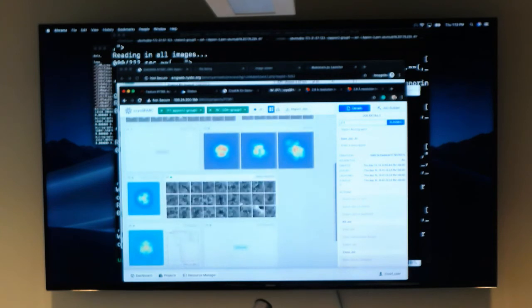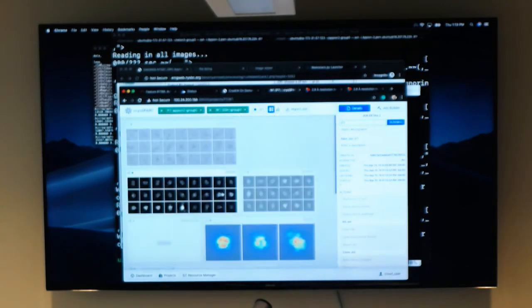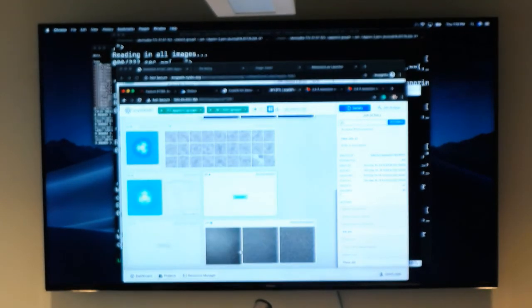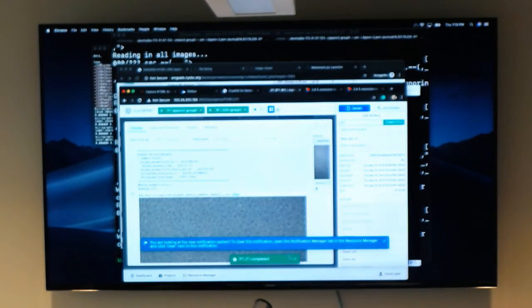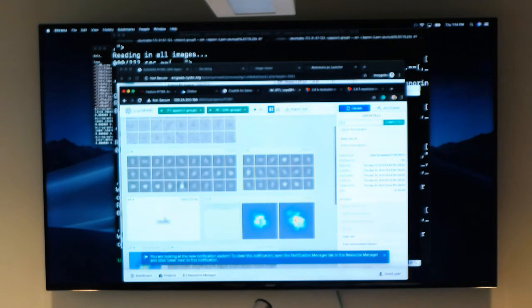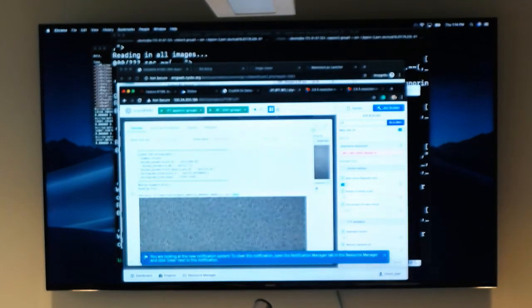Then the setting is based on, assume we run the heterogeneous, for this one. I assume they already did some scoring, so to choose it as part of the process.